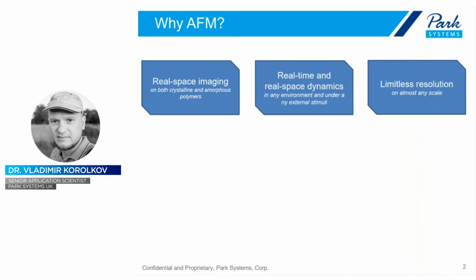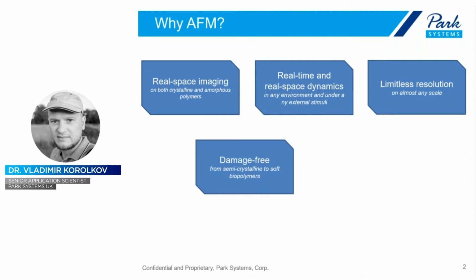Then another important advantage is that atomic force microscopy can provide you with the limitless resolution on almost any scale. You can look at your samples on a millimeter scale or go all the way down and achieve angstrom scale resolution. Then atomic force microscopy in general is damage-free and extremely gentle technique.